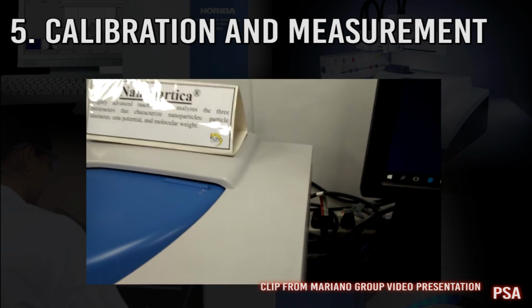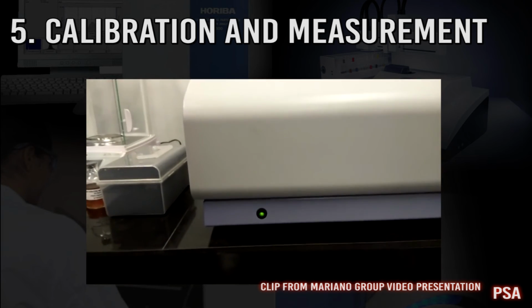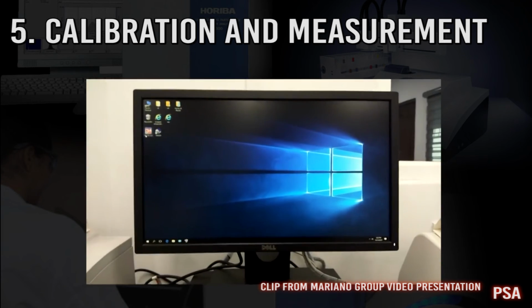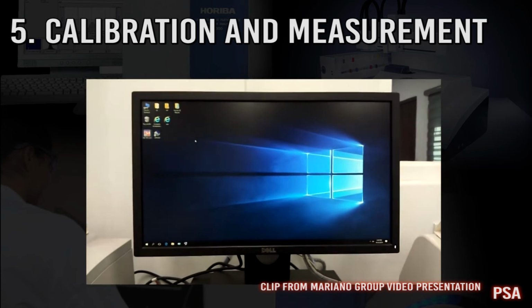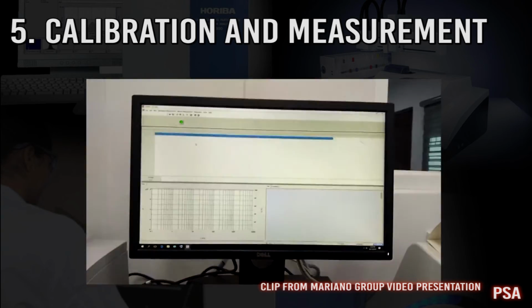For the measurement proper, the software installed in the computer was clicked, where the appropriate measurement that is being done was selected, then the temperature was configured. Wait for the cell temperature to be controlled until a change in color of the settings is indicated, which means that the temperature was now set.